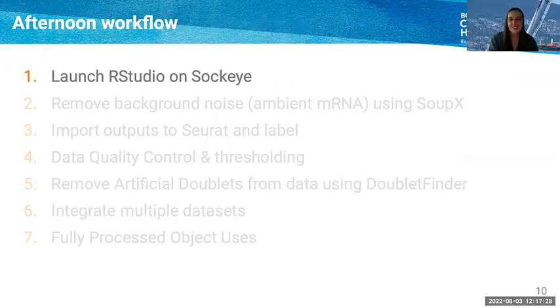We're going to launch RStudio on Sockeye to begin. Everyone should be logged into Sockeye right now. And if you're not, hop on.